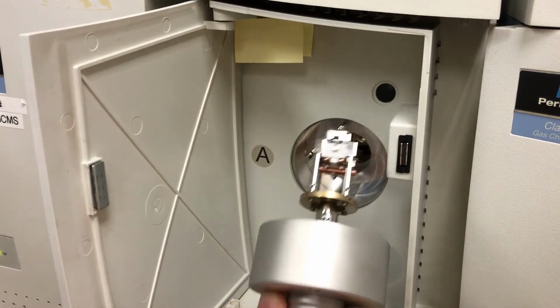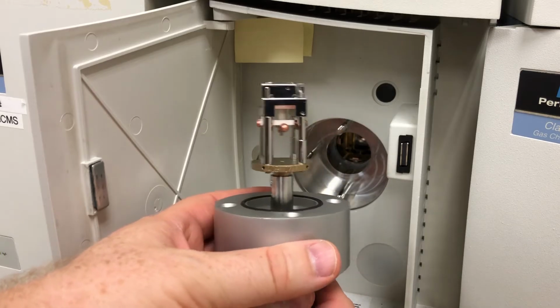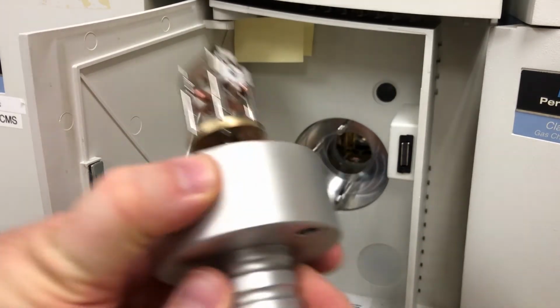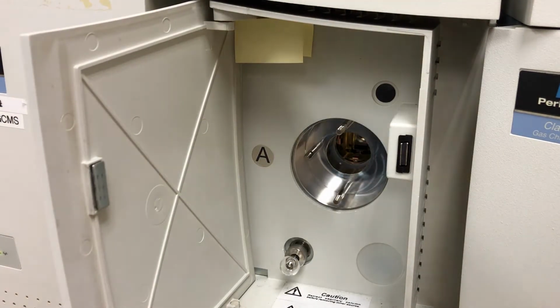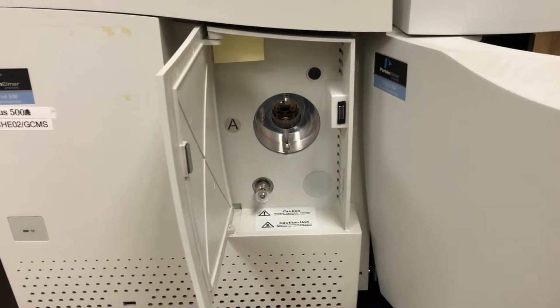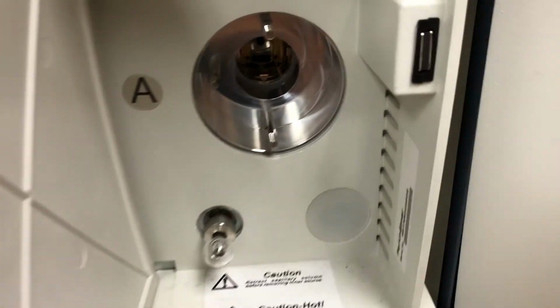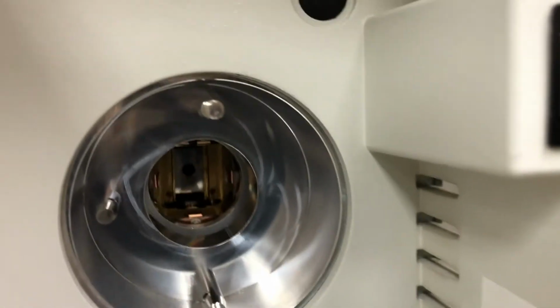So let's pull this source out and take a look at it, and we'll take a closer look at the components of this chamber later. So this is our EI source on the GCMS. And this is probably the most common ion source in all of forensics, next to electrospray for LCMS, which they use in toxicology.